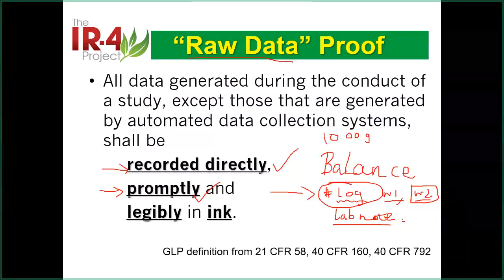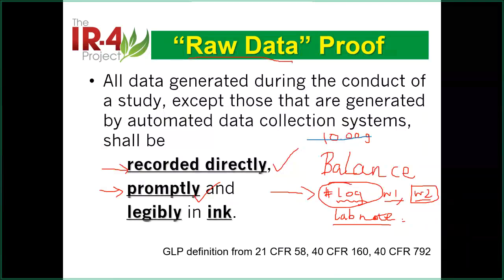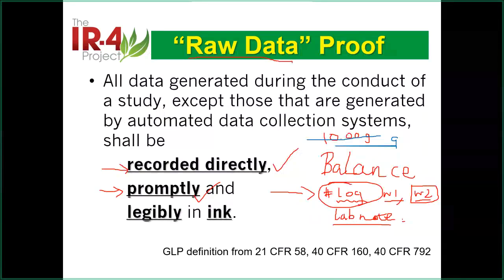Later, a mistake was found. So they crossed this out and said, oh yeah, I made a mistake, this is 9.8 grams, for example. That's the same case, but not exactly the same number, of course. Then they changed it to 9.8 grams, and between the original entry and the change, there were 6 months.